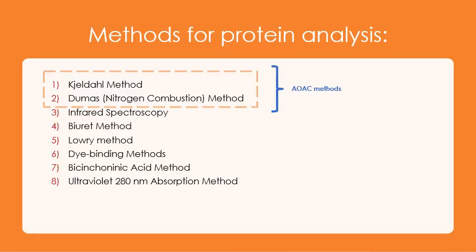But in this lecture, I'm going to keep it very brief and simple. I'm not going to cover protein purification or profiling proteins. I will be focusing more on measuring the concentration of proteins in a sample.